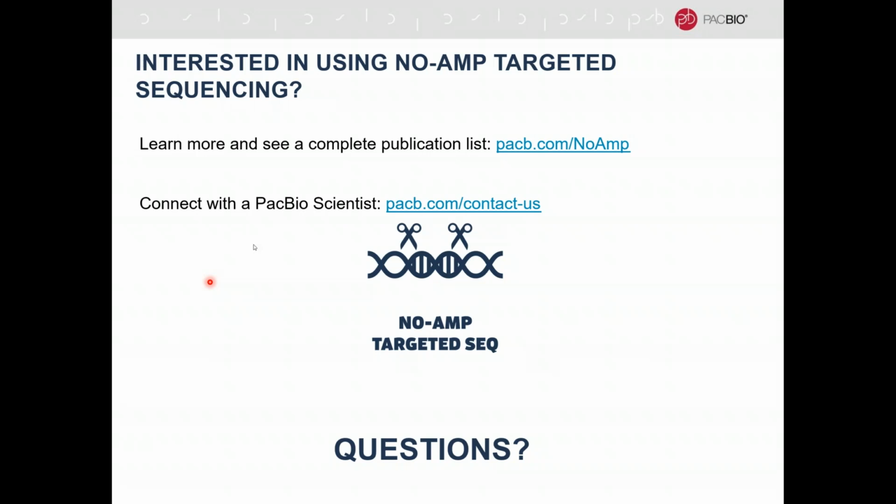So you want to have these highly accurate reads, especially if you want to look at mosaicism, and that will be your biggest limit on how far you can go if that's what you want to do. You can also, of course, acquire consensus through several different molecules if you're not really interested in the individual molecules per se and the mosaicism. So then you can probably go much higher in the insert size, but we really haven't tested that. Yeah, that's a great answer, Jenny.